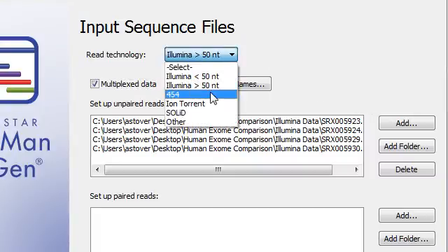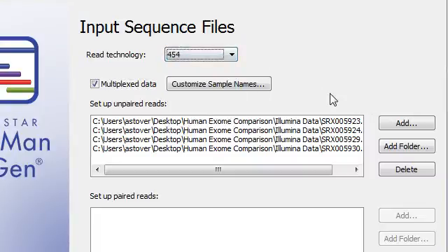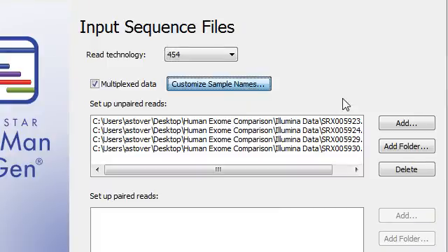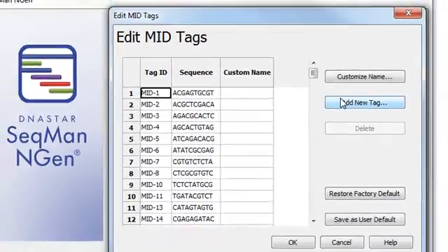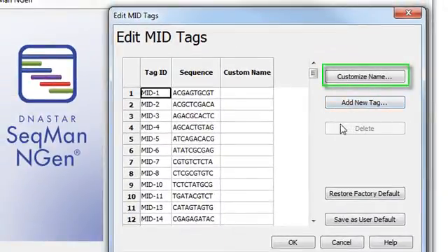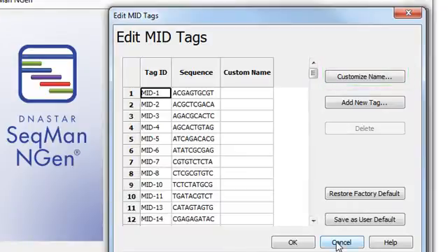For 454 or IonTorrent data, your samples will be separated using standard MID or barcode tags, or custom tags that you define.